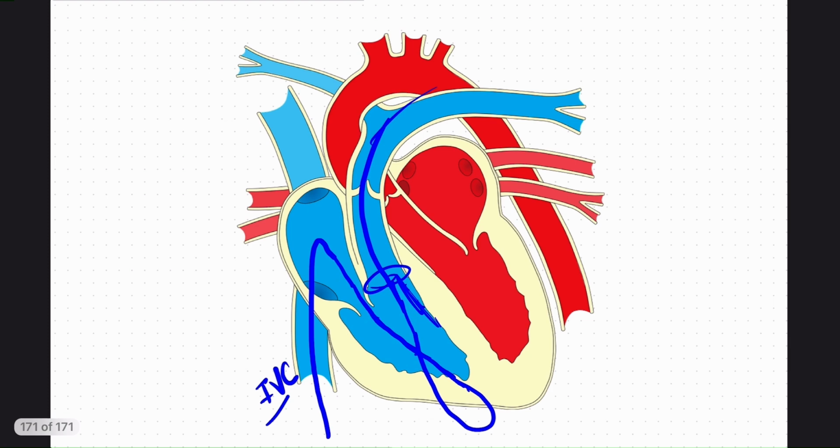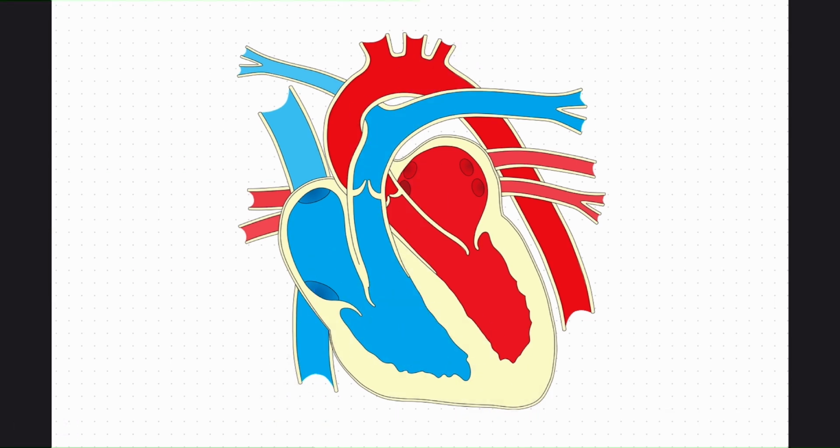Let us see this in the diagram of the blood flow. Here you can visualize there are two sets of pulmonary veins, right and left, upper and lower pulmonary veins. The initial incision is given in between the right upper and lower veins. Extend this in between the upper and lower veins on each side. Take this incision laterally towards the left atrial appendage to the inferolateral aspect of the left atrial wall. Cut through the posterior leaflet of the bicuspid valve and enter the left ventricle.